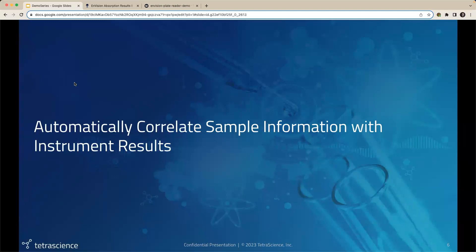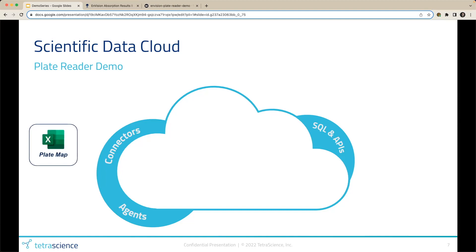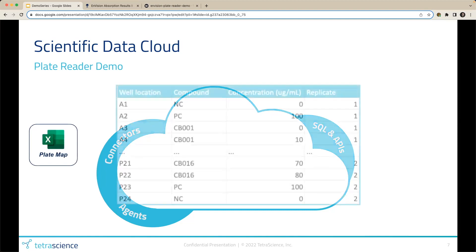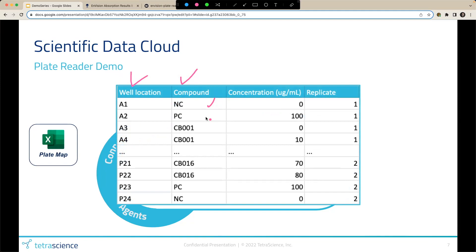First, we'll use the scientific data cloud to automatically correlate sample information with instrument results. A component of the scientific data cloud is the Tetra data platform, which we can view as this cloud in the middle of the screen. Say I'm a scientist running a plate reader experiment. The experiment's going to start with an Excel-based plate map. We're looking at a 384-well plate map with our well location, compound information, including our negative and positive controls, as well as compound identifiers, our concentration, and replicate information.